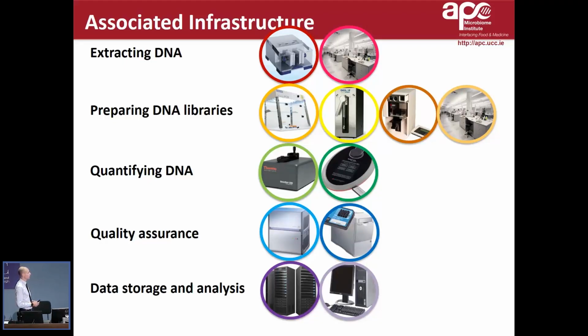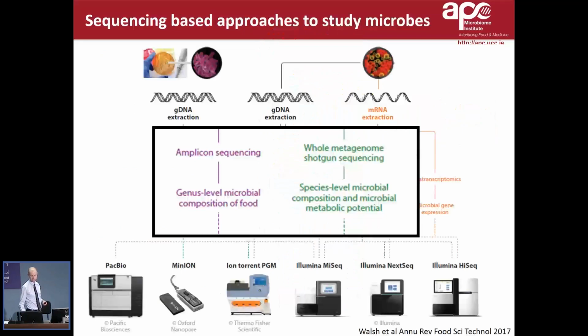So initially, for quite a number of years, people came to us because we had expertise in being able to generate DNA sequence data, but increasingly people are coming to us now because we can also help them in doing the analysis. One can get commercial providers to do analysis for you, but you just need to be a little bit careful about this kind of plug-and-play type approach, because quite often the way in which you carry out an analysis will give you completely different results. So you really should have good oversight or good appreciation as to why a particular strategy is being used.